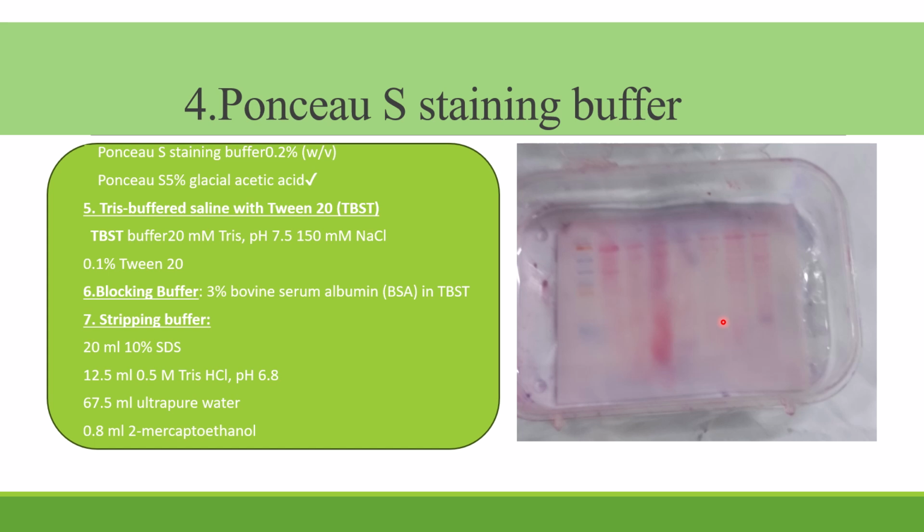Western blotting is very tedious. It is easier, but it is tedious and time-taking. If things are going well, it is okay. Suppose your transfer is not proper and you kept it for 12 hours of antibody incubation. Suppose it fails here, right? If it fails, you will not get proper results. That time will be wasted, your experiment is not going to work. So for that, if you suspect that the transfer might not be okay, you can check and not go forward. So moving next.